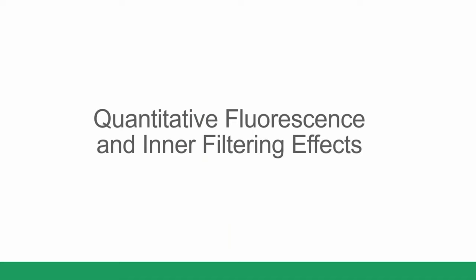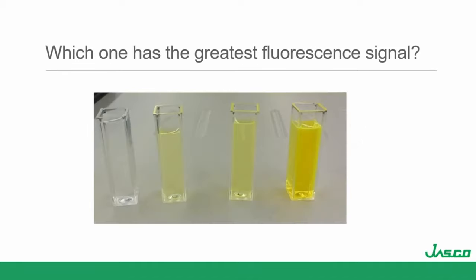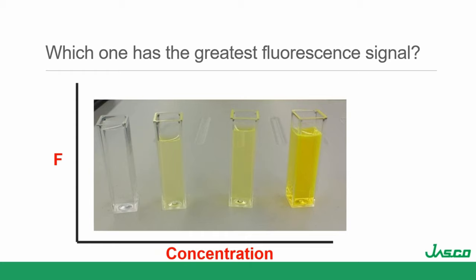A lot of folks don't think much about inner filtering effects. There's a picture of four fluorescent solutions — which one has the greatest fluorescence? If I plot fluorescence versus concentration — I'm pretty low for the most dilute solution, I get an increase in the next one, but already in the third one the fluorescence begins to decrease, and in the last one it's less than the fluorescence of the most dilute solution. We get this rollover — as seen in absorbance — due to these inner filtering effects.